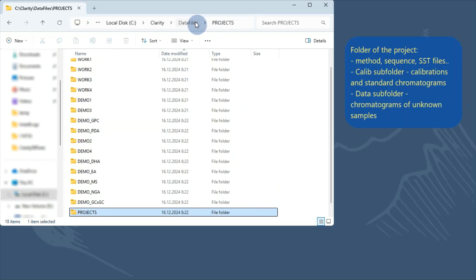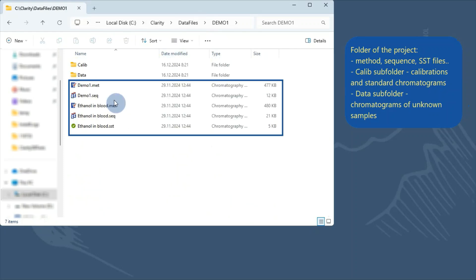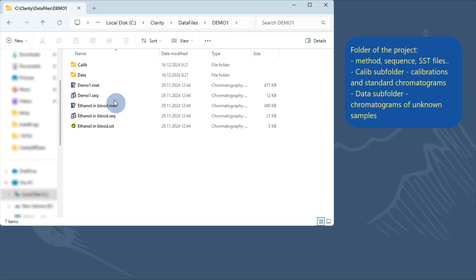Next, I will illustrate the structure inside the folder for each project. Directly in the folder belonging to each project, you can find all methods, sequences, and SST files of the project. There are also two subfolders by default.